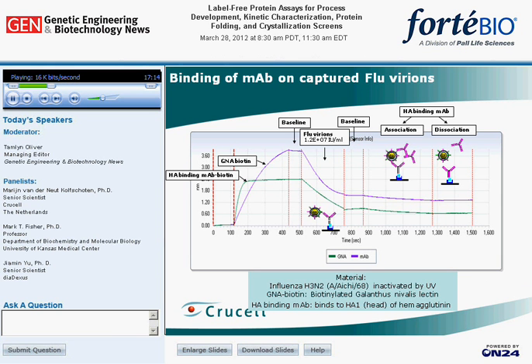The last example of this presentation involves the measurement of binding of an intact virus, influenza in this case, to the sensor. 2 capture strategies were followed to capture the flu variants. One was using a lectin, and the other was the use of an HA binding antibody.